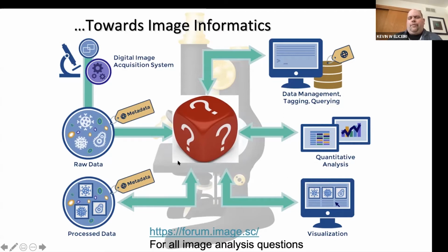A lot of this work we've done with partners, notably the Open Microscopy Environment, which has been very active in this area. And they've been very active in CZI as well with their Bio-Formats efforts. And we've been involved in the early stages of that as well. A lot of efforts with Micro-Manager, and quite involved in this meeting as well. And Nico Stuurman is a new fellow working on this. And then of course, ImageJ and KNIME and CellProfiler are examples of analysis tools, but there are many, many others.